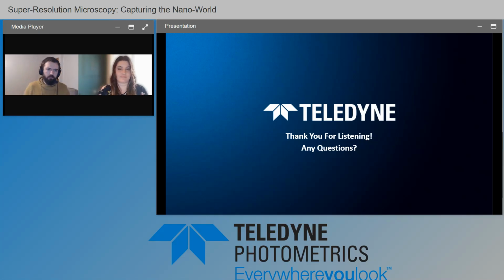But this is another disadvantage, because at a certain point, you don't know if what you're seeing is the truth of what your sample actually looks like at a super resolution level, or if you're looking at something that is generated by the algorithm that you have. And groups that use super resolution very frequently often have their own algorithms to refine how the image looks. If you're sampling at Nyquist, you can have oversampling to try and pull more resolution out of your image.